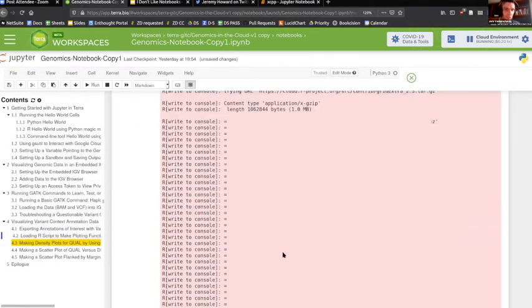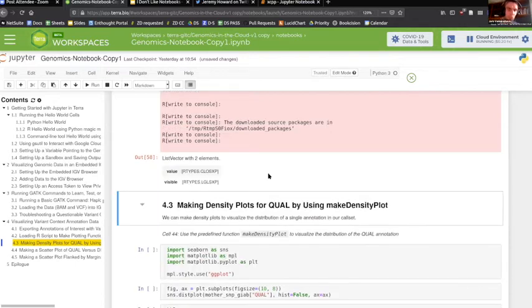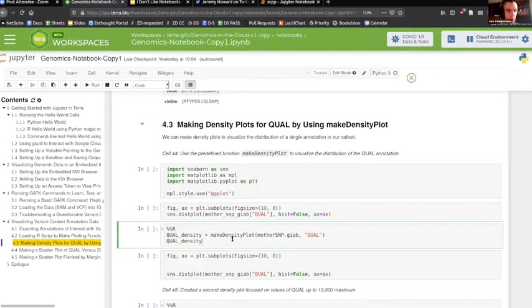And as you can see, there's a lot of logging output here in ominous reds, but you can ignore that. The upshot is basically that we have some new plot functions that we can use to plot the variant call data that we've loaded in. Again, there's a couple of cells here that I will skip over. Those were Python experiments. I'll come back to those after running the R cells first.